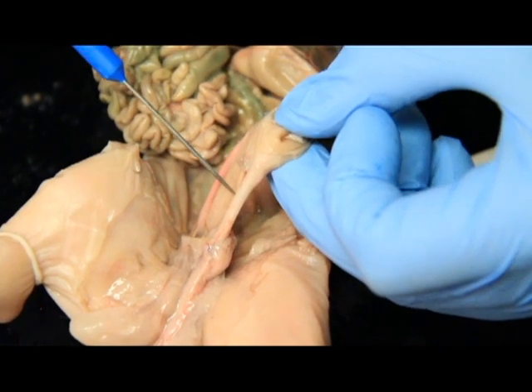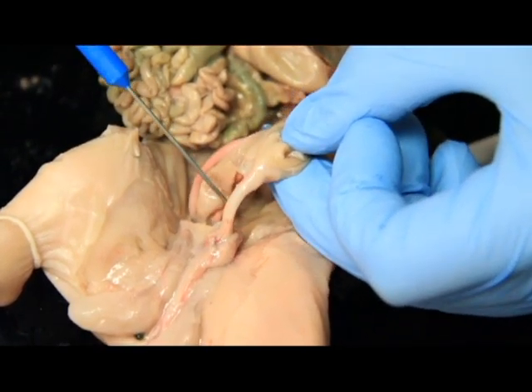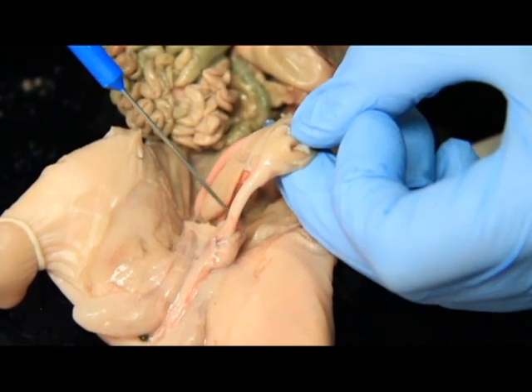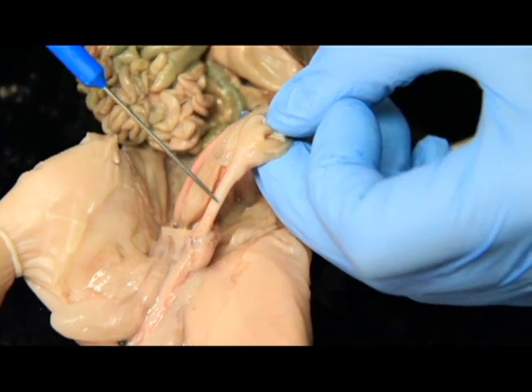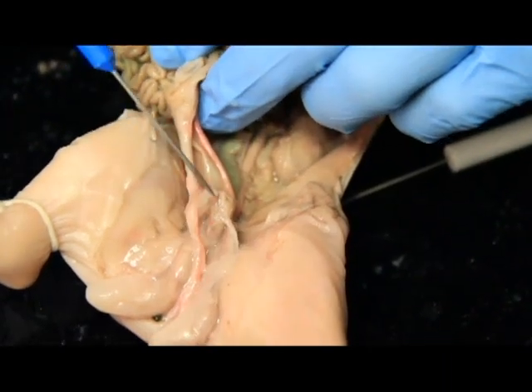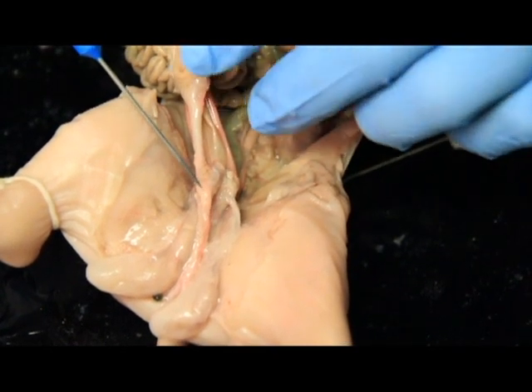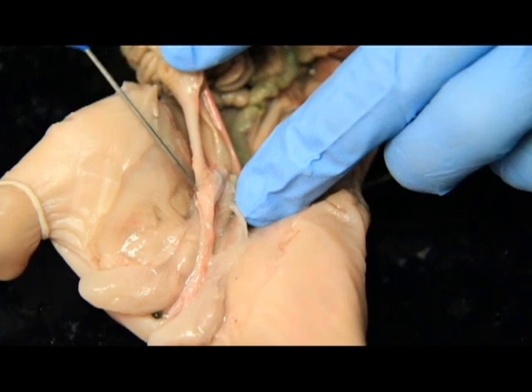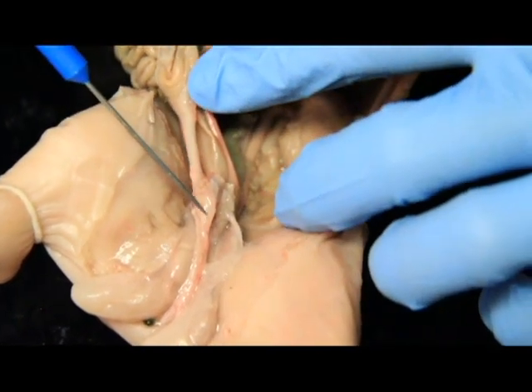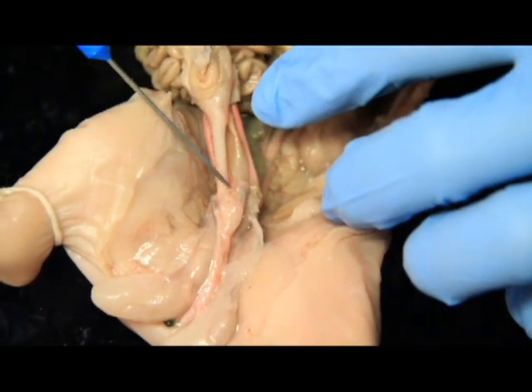So then you can cut away all this excess skin, and there's going to be a lot of excess skin in between the urinary bladder and the penis. But to see it very clearly, you want to cut away all that skin in between. So then as you follow this down, you're going to get to this bulbousy glandy looking thing right here, right on top of the penis, right before you get to the urethra. That is going to be your bulbourethral gland. And bulbo, again, kind of just means bulbousy. So this big kind of fleshy, glandy looking thing right here, that's your bulbourethral gland.